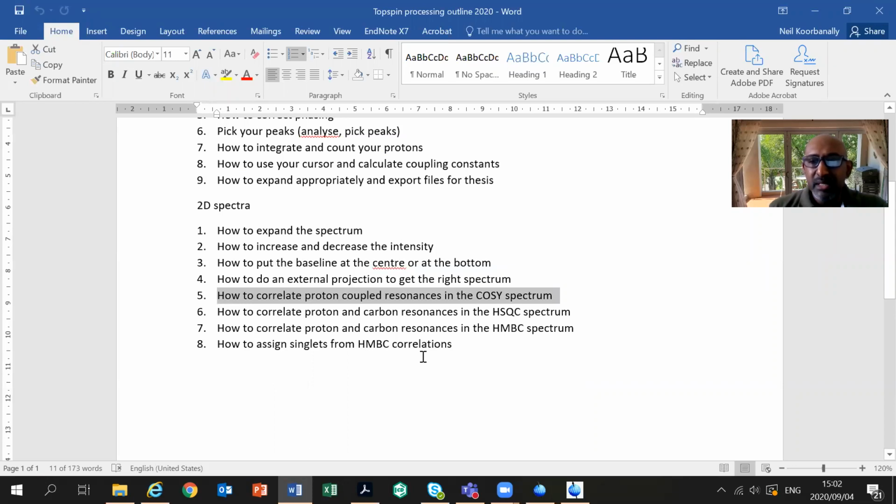So for every carbon atom and every hydrogen atom, you must have at least an idea of where those proton and carbon resonances lie in your spectra. That's what you're going to use to convince someone that you've made a particular compound, or that this is the structure of the compound that you've made or found. Remember that when I first started off, I did natural products. I got compounds from plants, and I was able to say that this compound that I found in this plant has this structure, and this is why it is the structure.